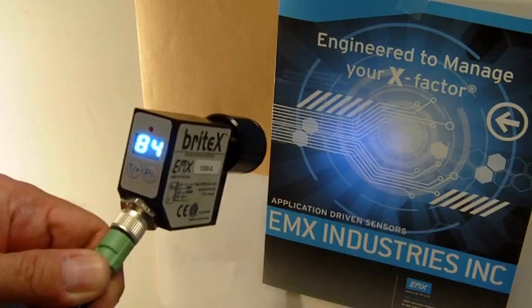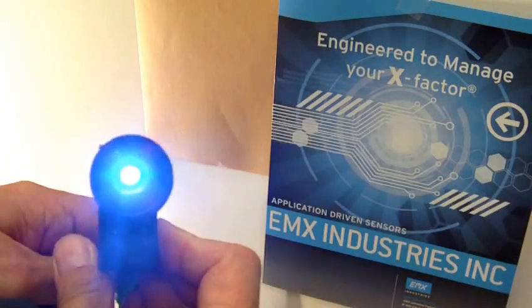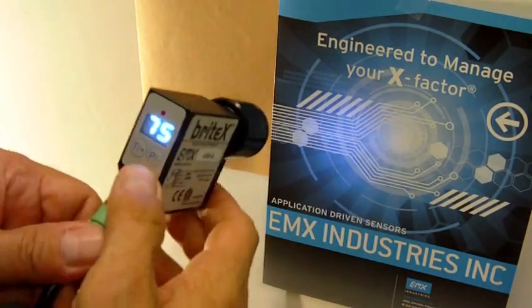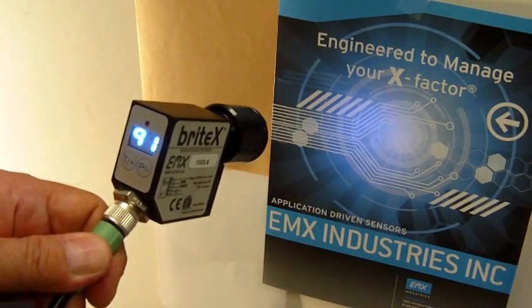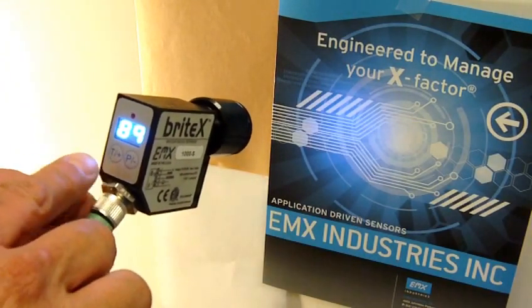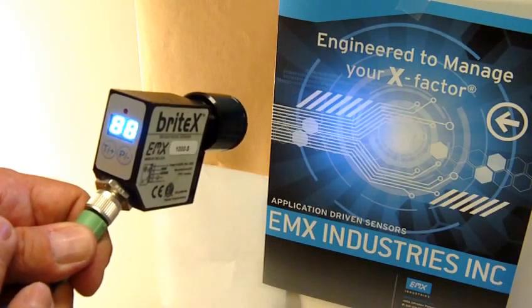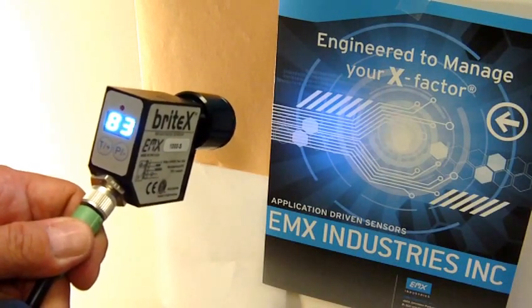The sensor features a high sensitivity receiver, a blue 457 nanometer light source, and a two-digit display which is an indication of the signal strength — or the amount of light that's reflected back from a target surface. Internally, there are several settings in the menu for setting the light source intensity as well as gain settings for optimizing the sensor in a specific application.